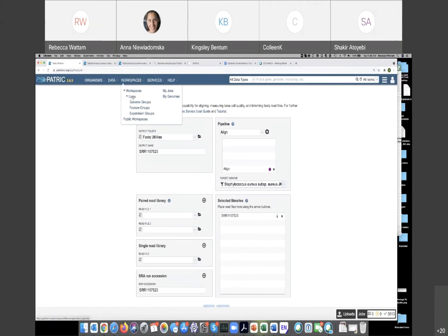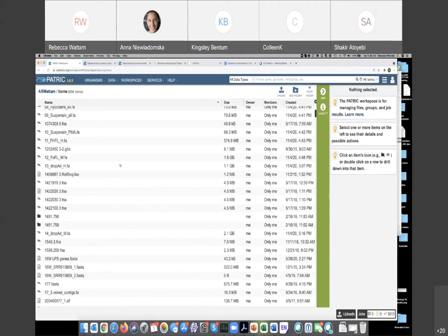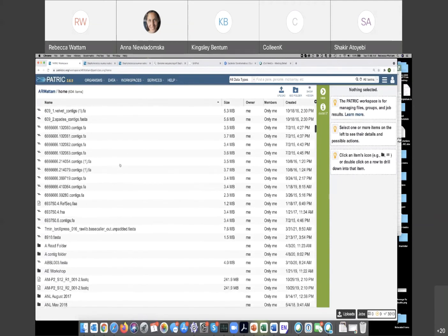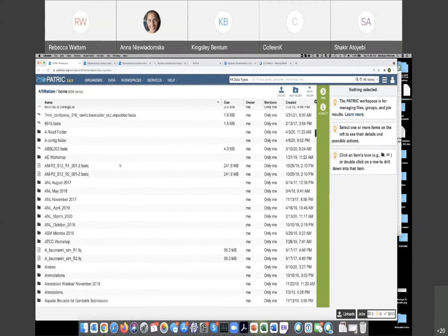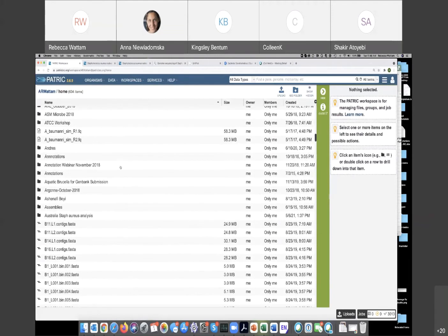my home directory. And I've had this workspace since about 2009, when I first started using it, and it also continued with me being very messy. So this is sort of like when someone comes into your house and they accidentally open your closet door when they're looking for the bathroom or something, and all of your things come falling out onto the floor that you stuffed in so your house would look clean. That's what you're seeing in my workspace. I would encourage you to be a neater person than I, because I've had this workspace for a really long time and it's really disorganized and chock full of junk.